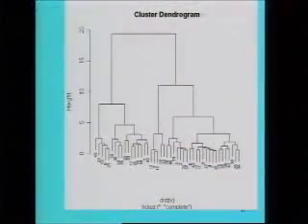Same thing can be revealed in dendrograms. So this is a hierarchical clustering procedure. Use any linkage method, single linkage or complete or average. What you notice is that the 6 groups can again be identified here.